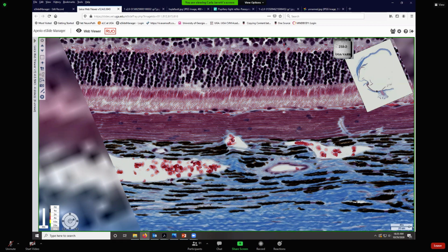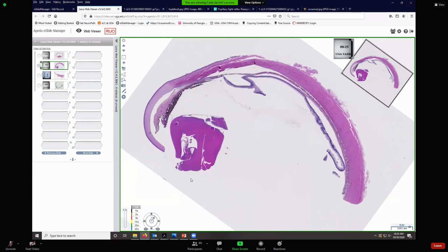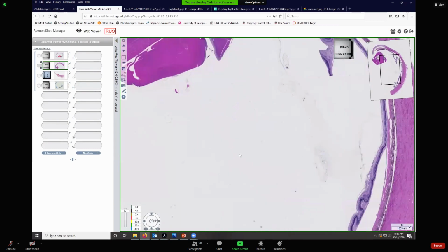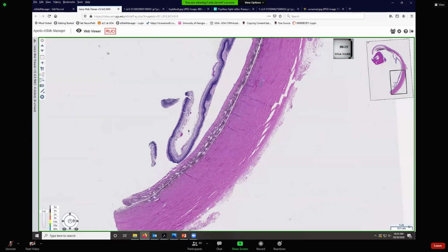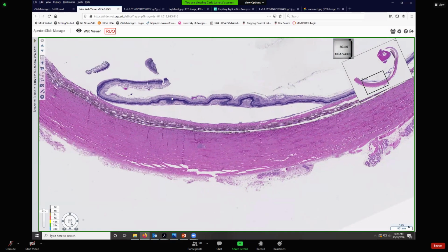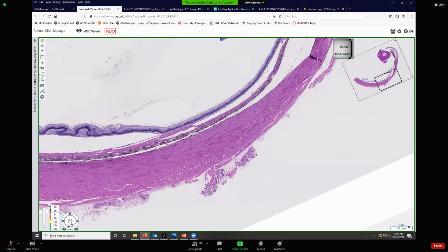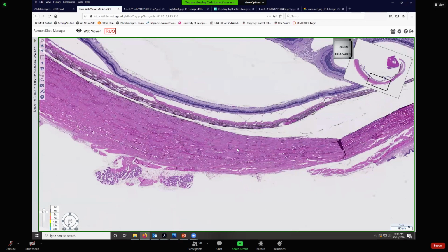All right, so there's one more type of tapetum, and that is in herbivores. In herbivores, they have a fibrous tapetum. Okay, so let's zoom in on it. Rotate this around a little bit. Come on, turn for me. There we go. Here, our visual retina is just artifactually separated. It loves to do that because the vitreous body is not there to mash it down.